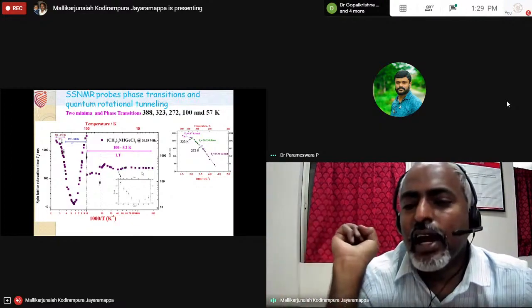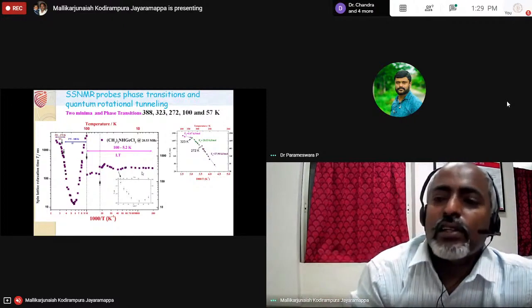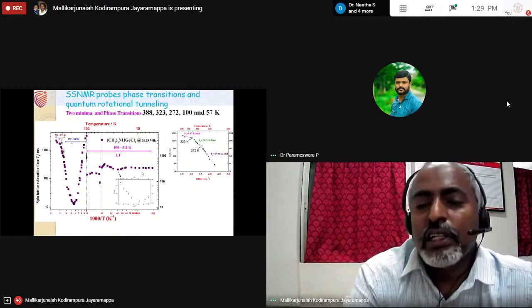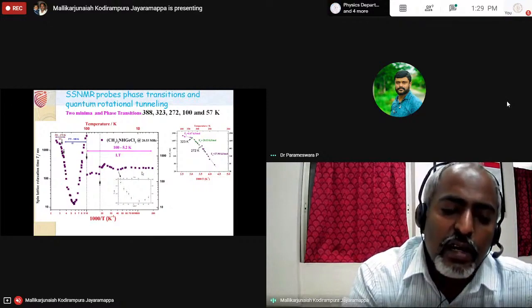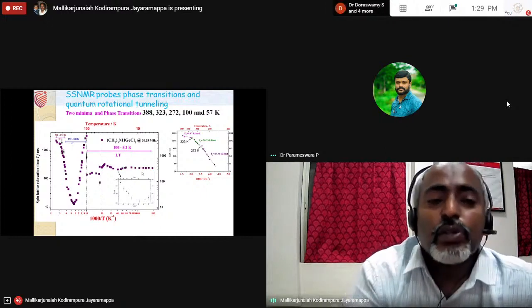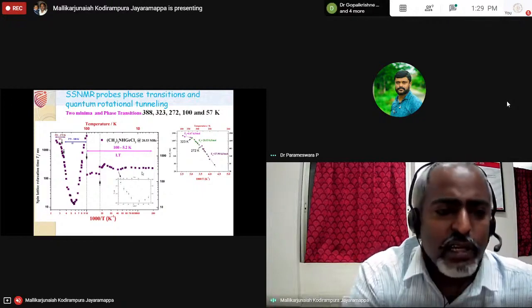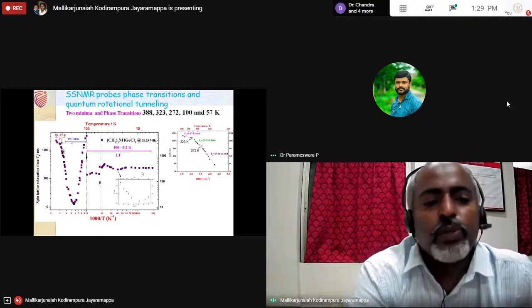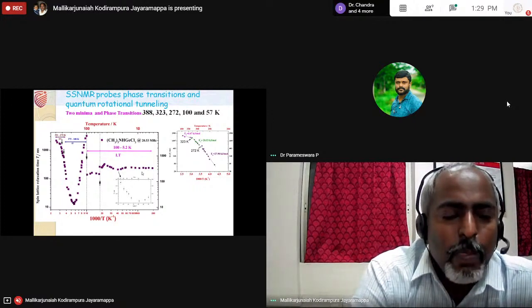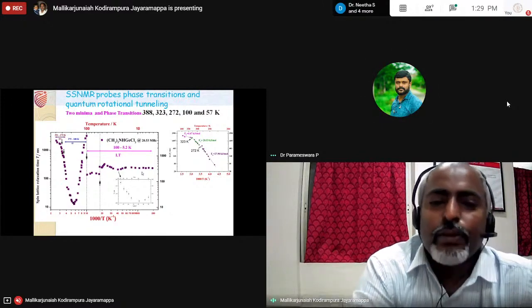If I take an iron rod and keep it here, why am I not seeing 33 Tesla? If it is that sort of common sense question, then obviously the 33 Tesla is felt at the site of the nucleus, not outside. That's why we don't see it. But the 33 Tesla is a well established technique. We ourselves have performed experiments on that. I hope if he wants clarification, I can give it.